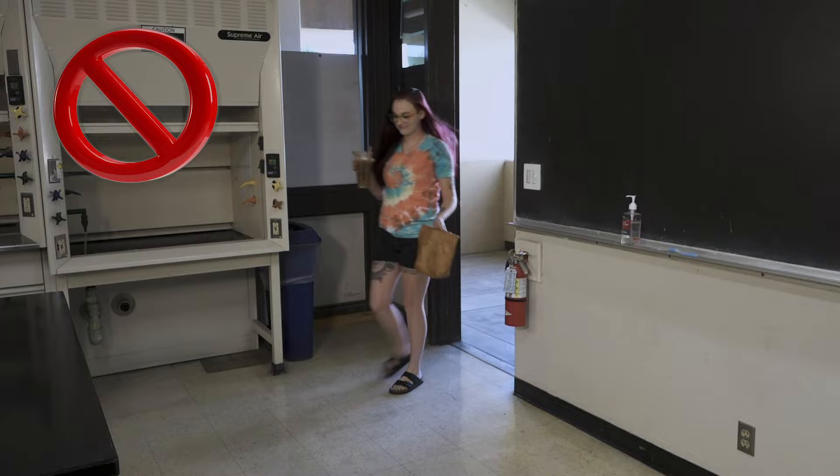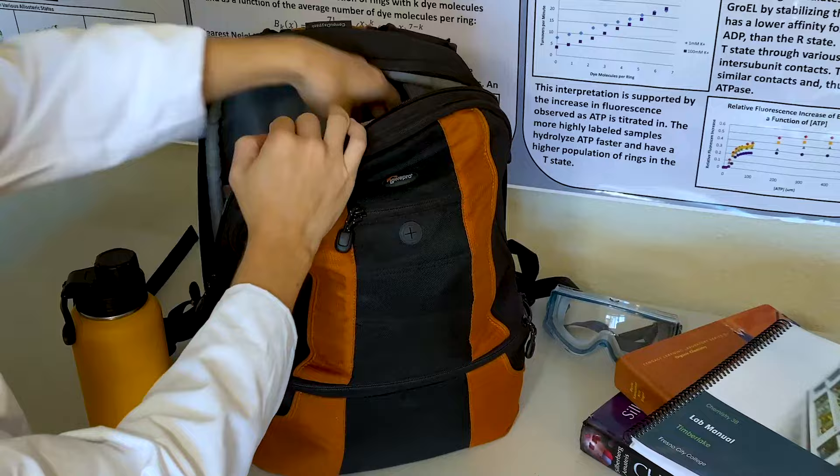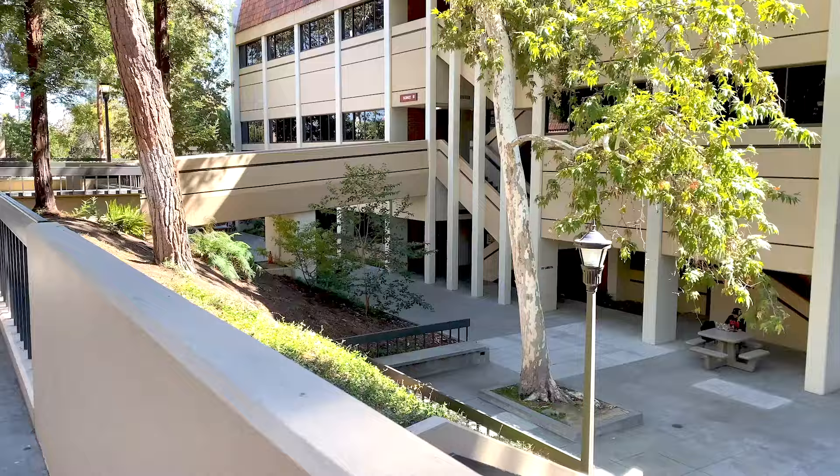Laboratory safety starts before you even enter the lab with your chosen lab attire. Eating and drinking are not permitted in the laboratory classroom, so please leave all food and drink outside the classroom or safely secured in your backpack. Before arriving to class, you need to make sure you're wearing the proper clothing.